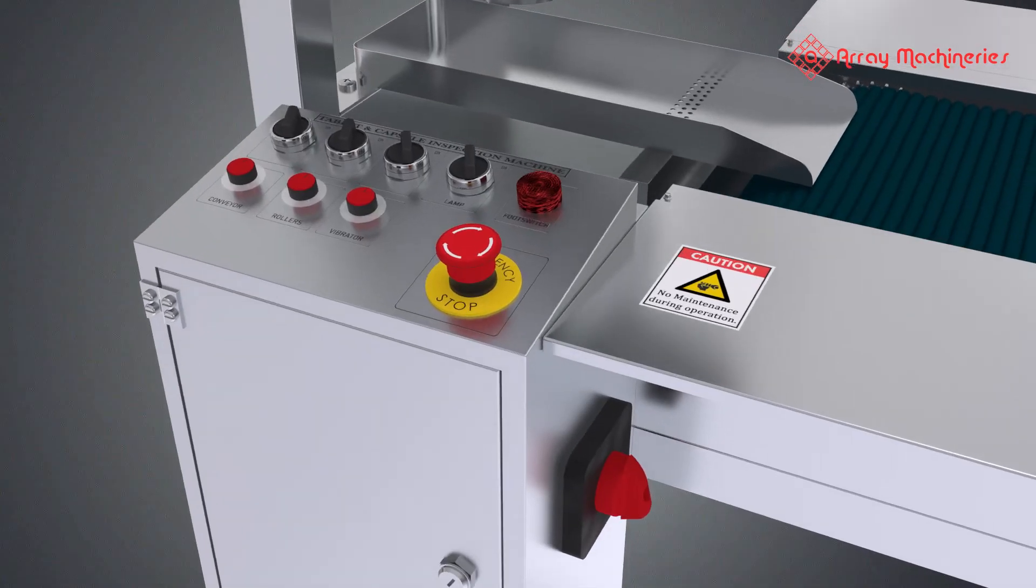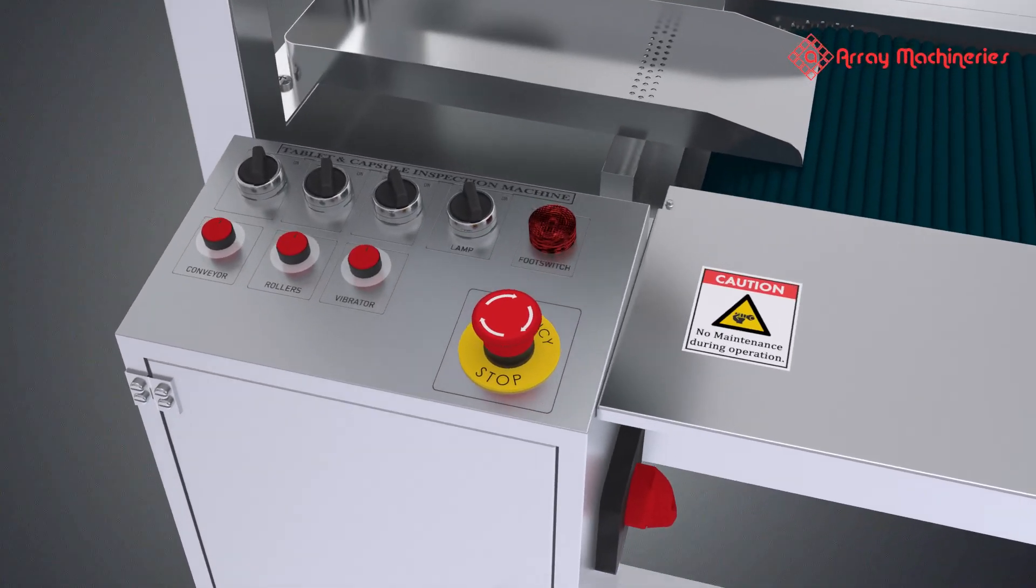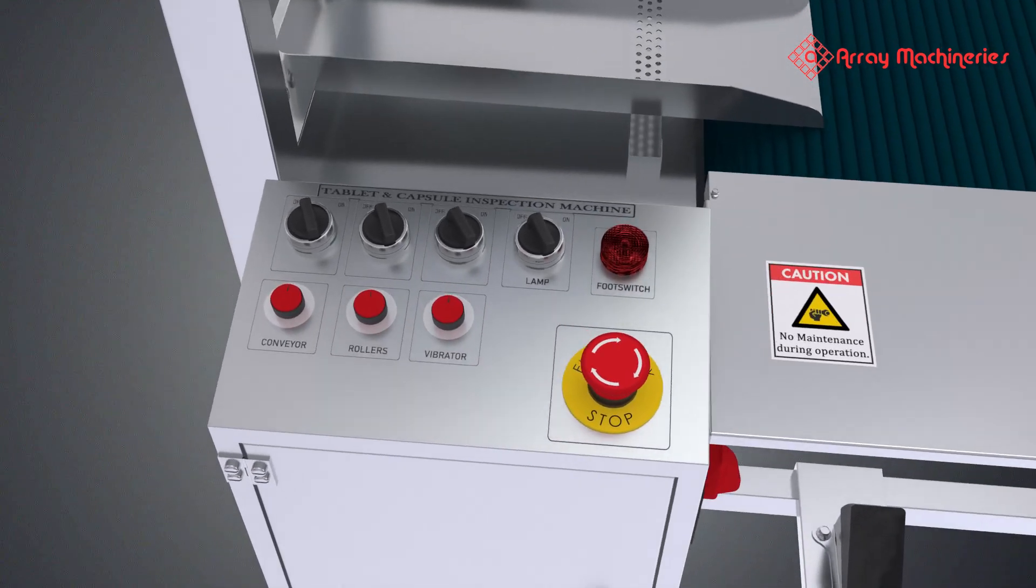All the start/stop, emergency, and speed controls are given on the main control panel of the machine.